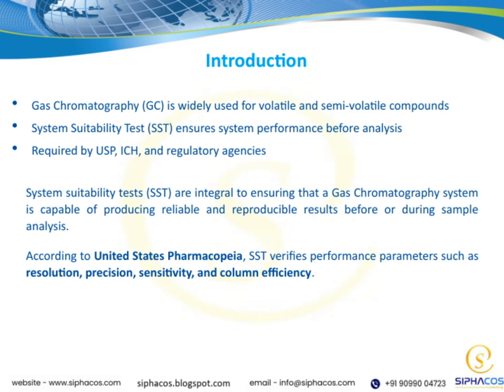According to the United States Pharmacopoeia, these tests are essential for confirming that our GC system is performing optimally. This is especially important because it helps us trust the data we generate, whether we're analyzing pharmaceuticals or other complex mixtures. In the context of our overall presentation, it's important to remember that SSTs are not just a regulatory requirement, they're a quality assurance tool.